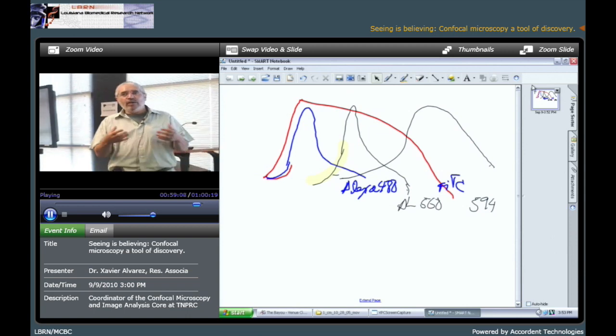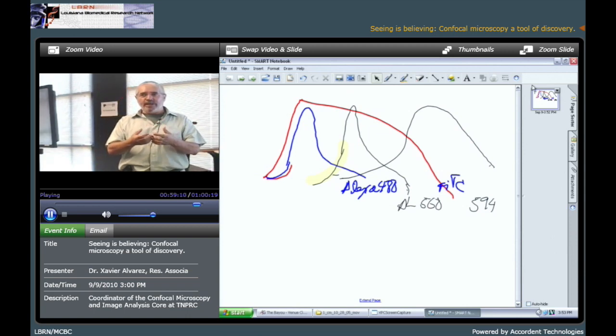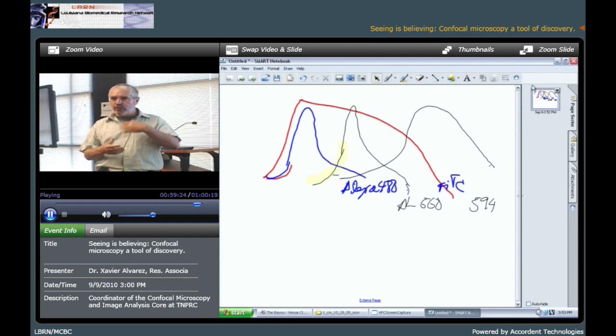In my hands, if it is before they come to me, I ask them to do this with something that is not FITC, and then we could image. If they don't have the antibody, I could send you the antibody, or you could come and stain with me. The secondary antibodies are relatively inexpensive because they last forever. We use them very diluted, 1 to 1,000. That's the reason.